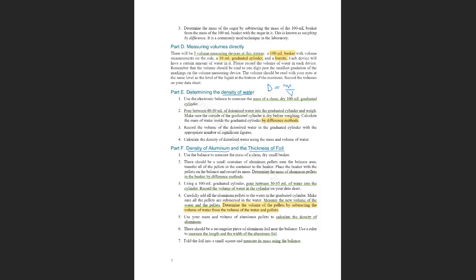The volume of the aluminum, we are going to calculate the way I explained before: we add the solid inside the water, and by the difference, we know the volume of the aluminum. Remember that?